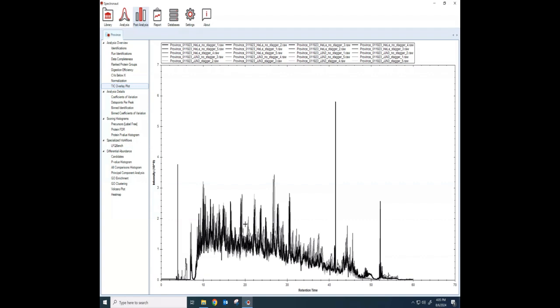Sometimes if there's a sample that looks a little doesn't seem to match well, I can come here and you can see that maybe there is a loading issue, maybe one of the samples just didn't have the same amount of peptides loaded as the others, either because of some sort of issue with the autosampler or something like that. And so you can see that easily here.